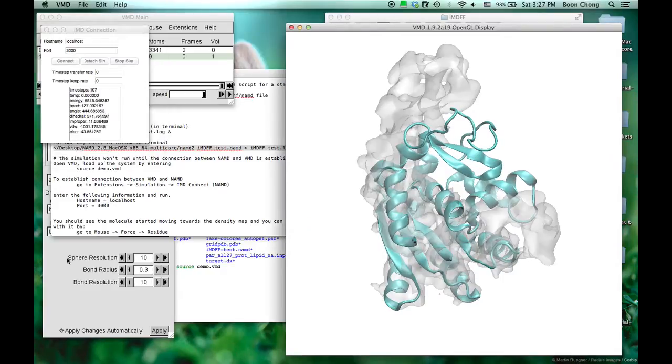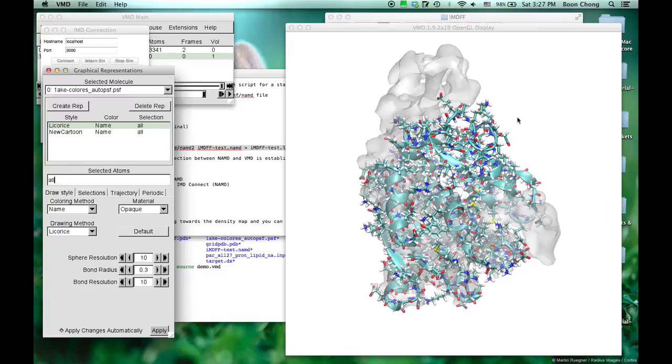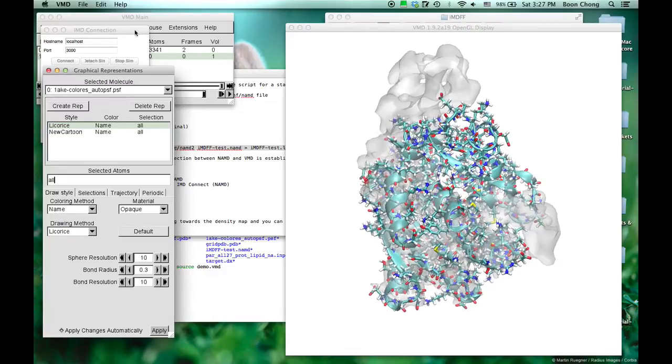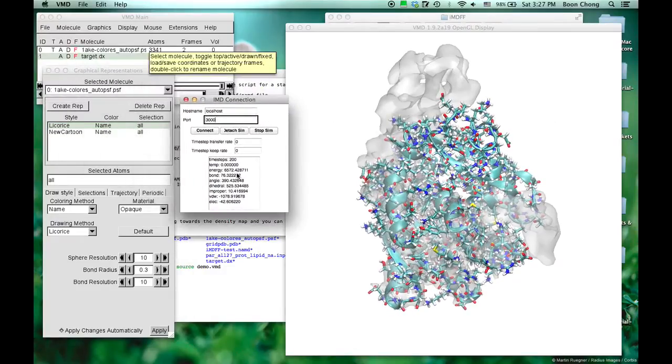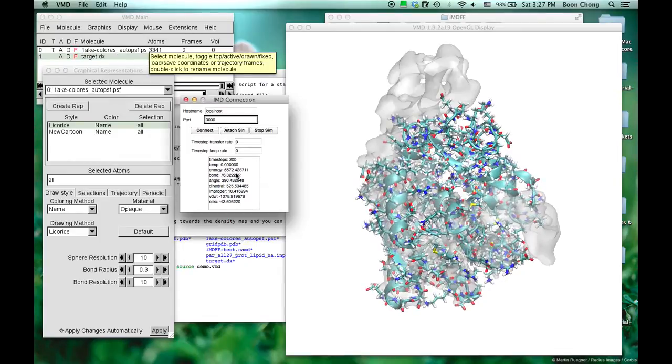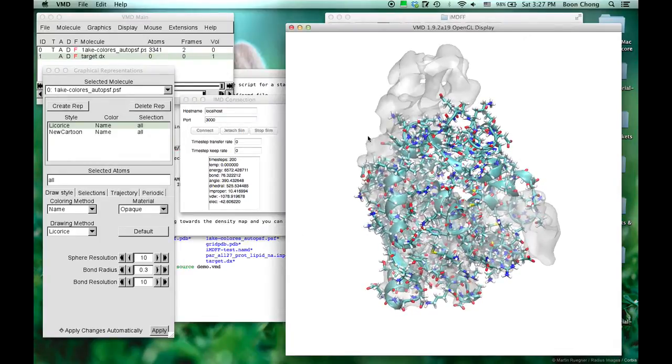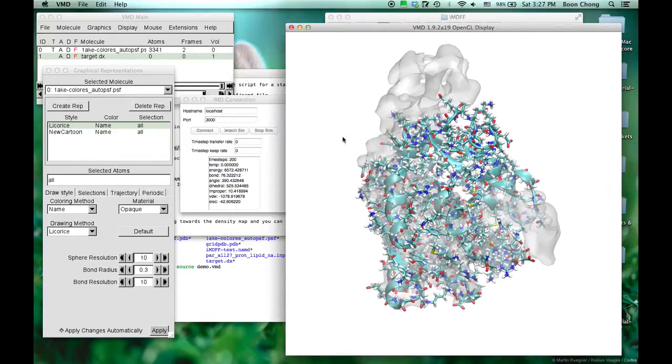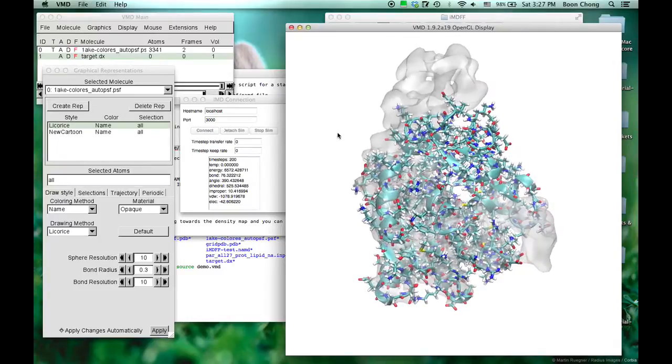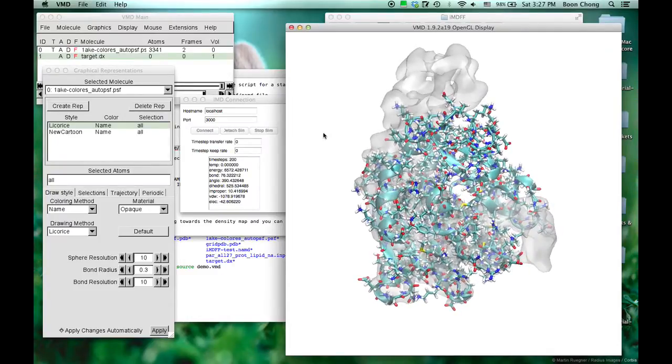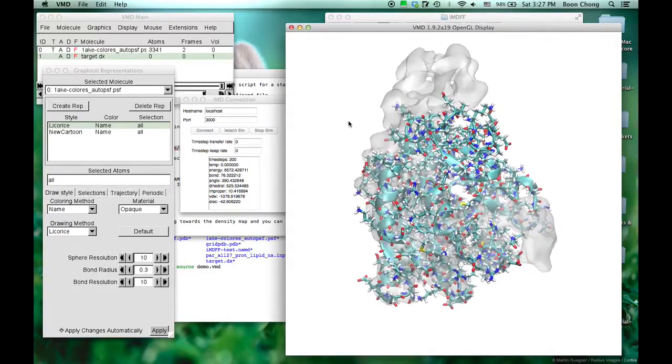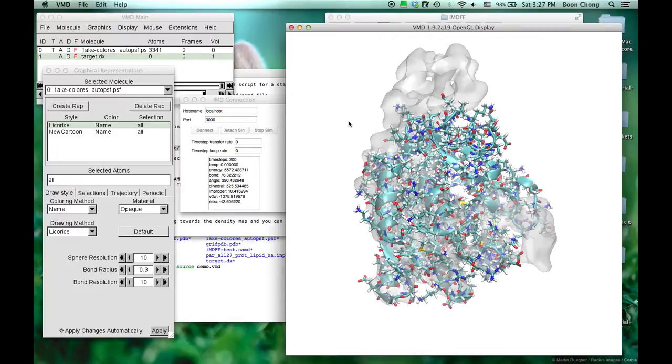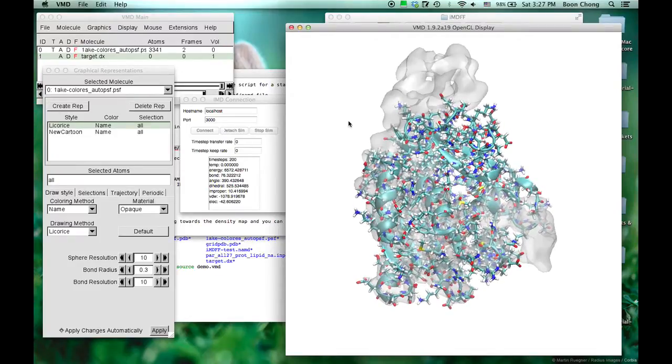What you see here is that the simulation is already running. And now you really get to interact with the molecule. This is really an MDFF calculation in real time.